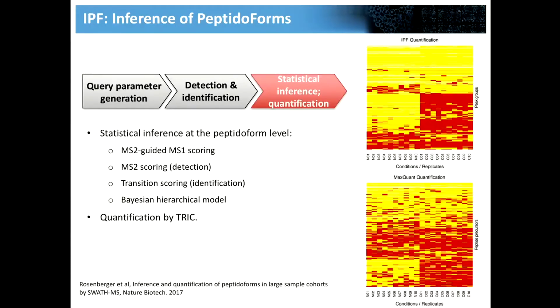If I understood you correctly, you're asking if we had the phosphorylated, do we also then go and assign an identity to the oxidated phosphorylated, for example? So we look and we say this mass shift is allowed. And this we don't do unless it was originally included when we generated the assays. So if we permitted here to also have an oxidation, then that peak would also be assigned as an oxidated phosphorylated, and that peak would be assigned as a phosphorylated.